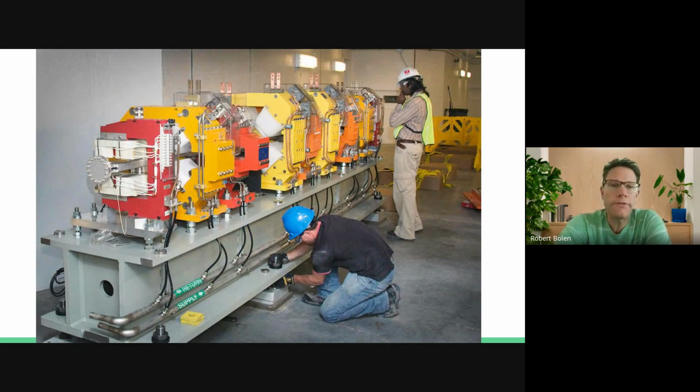This is another close-up view before these magnets are being put into position, and you can see that they're not quite hooked up yet. But on the top here, you can see these little forks. These look like plugs, and that's actually what they are. And they get plugged in to the electrical system, and that's what runs those magnets.